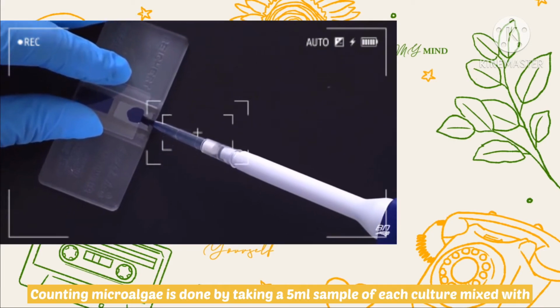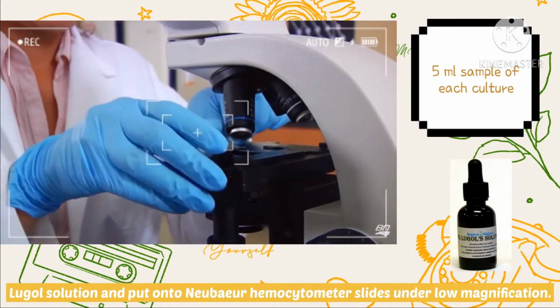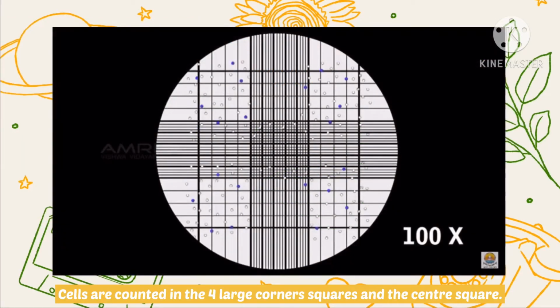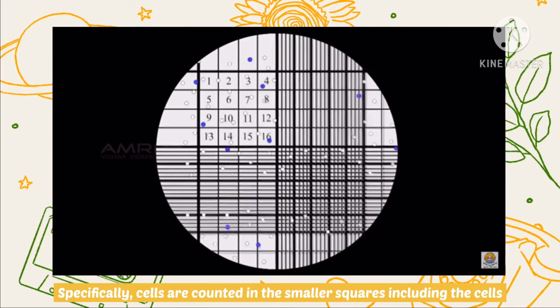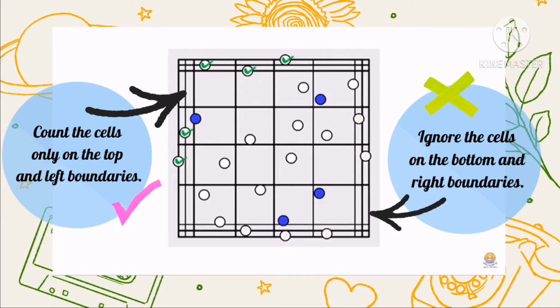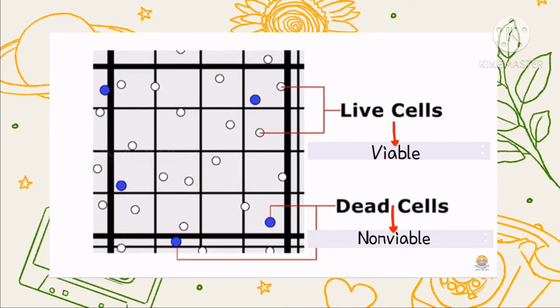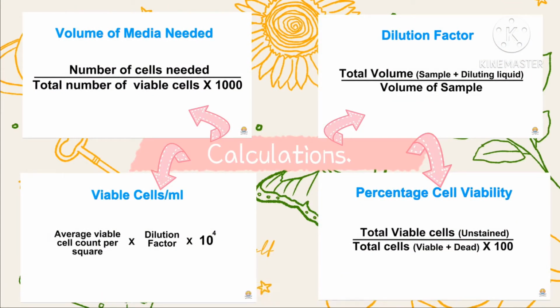Counting microalgae is done by taking a 5 ml sample of each culture mixed with Lugol solution and put onto Neubauer hemocytometer slides under low magnification. Cells are counted in the 4 large corner squares and the center square. Specifically, cells are counted in the smaller squares including the cells that touch the top and left boundaries. Live cells are colorless, while the dead cells appear blue. Total cells in the squares are recorded for calculations.